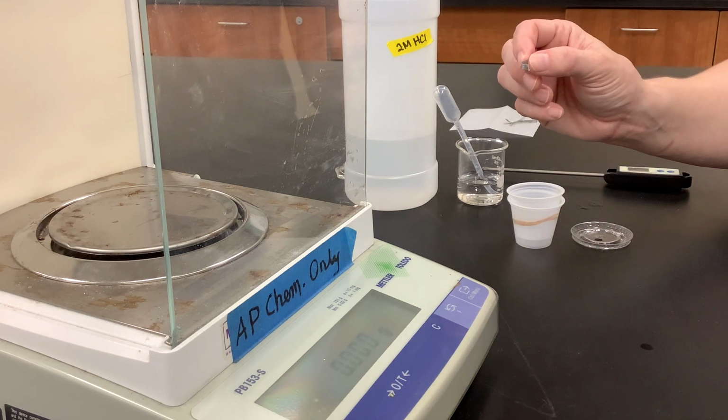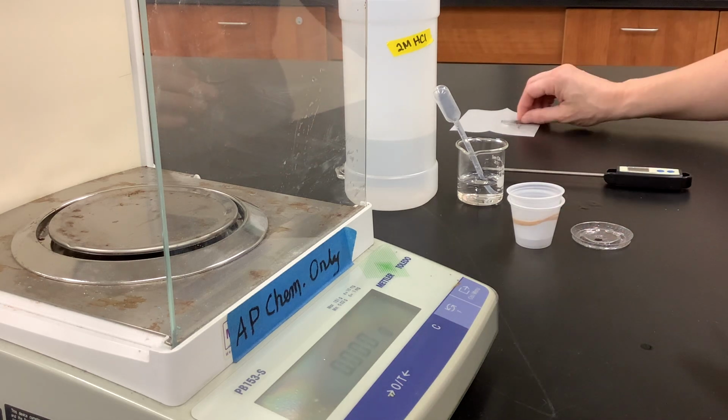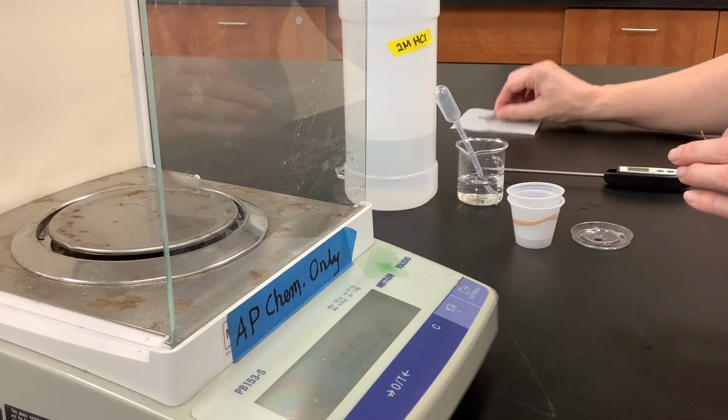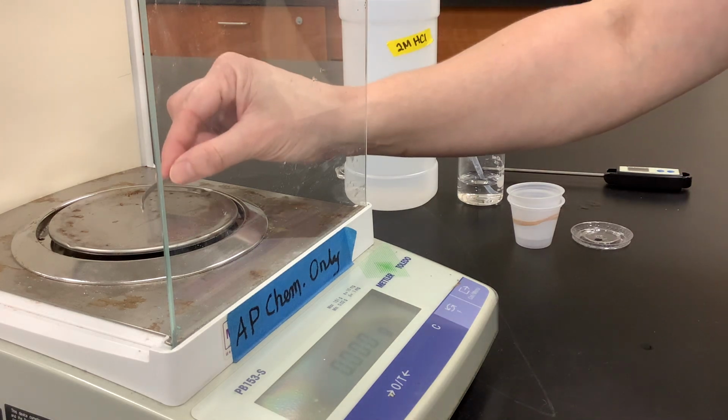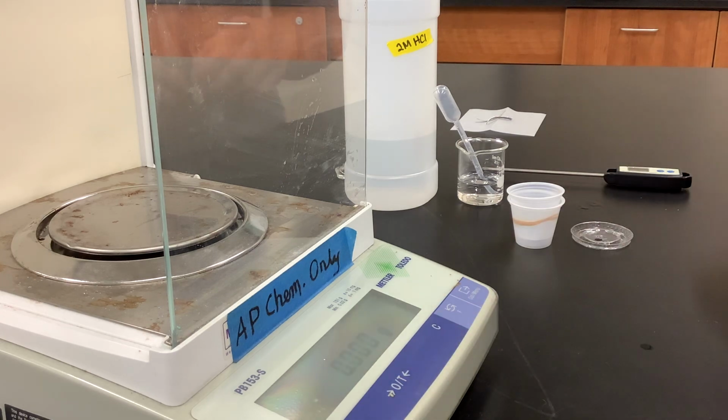The first thing we're going to do is take our first strip of magnesium and do our first trial. Then we have 2 more magnesium strips, and we're going to do 2 more trials after that. First, we're going to take our analytical balance. What I want you to notice about the analytical balance is that it has more digits to the right of the decimal. It's a more precise piece of equipment.